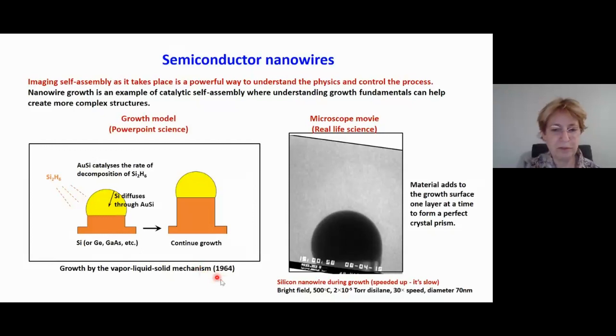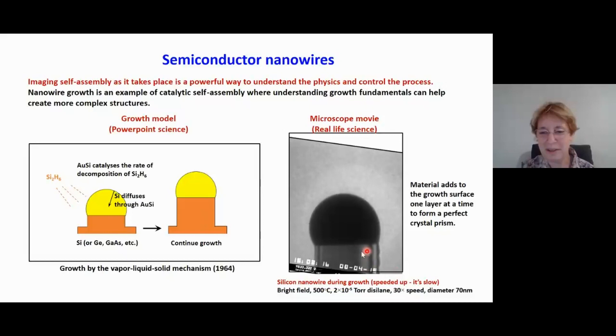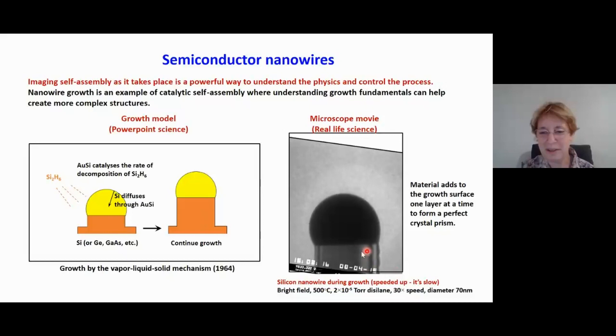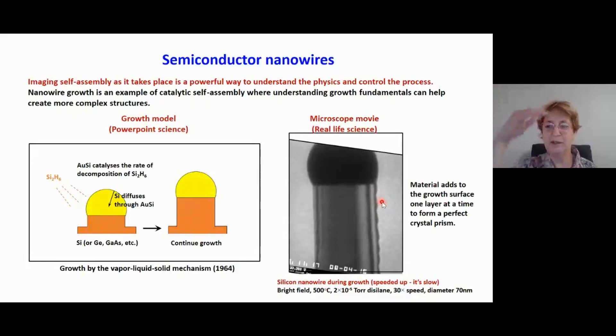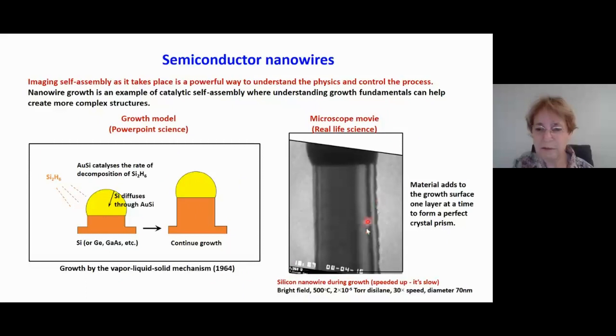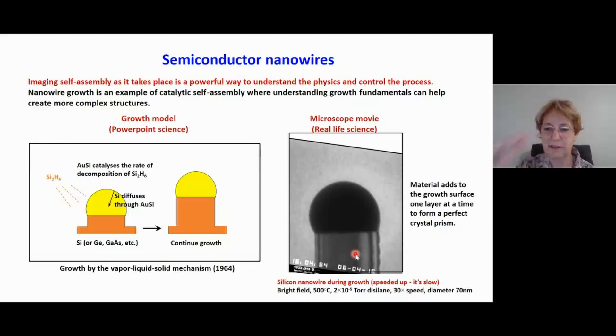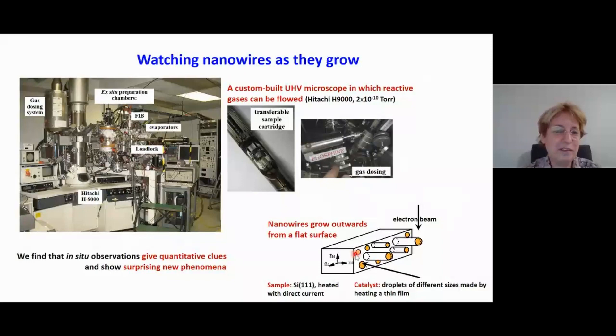This process was actually developed and understood from post-growth observations in 1964, an amazing piece of work done at Bell Labs. If we take this PowerPoint science and transform it into the microscope observation, look at what happens. It's actually exactly what we see in the microscope. Here's the nanowire growing. It's actually a hexagonal prism growing in the crystallographic 111 direction. This is a flat 111 surface. You can see it's growing, and I'm not just moving the sample because we have these features on the surface that are fixed. The wire is just growing and extending. As long as we do the experiment, flow the gas, keep the temperature up, we get the continuous growth of a perfect crystal. These lines are actually like contour lines on a map - they tell you how thick the crystal is at that point. Otherwise it's a perfect crystal, every atom is exactly in place.